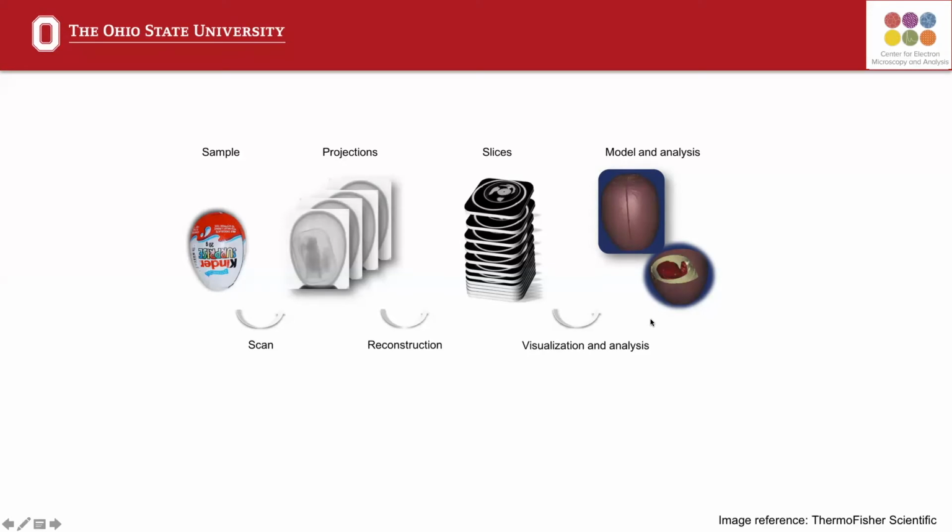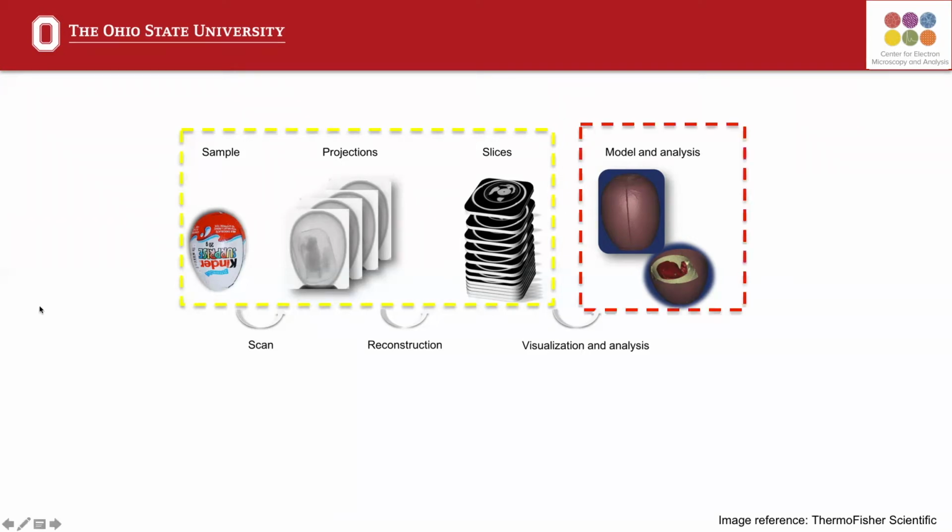I like to separate this workflow into two different sections. One of them is the acquisition and reconstruction stage. This is what actually takes place on the HeliScan. And then the second stage is the visualization and analysis.